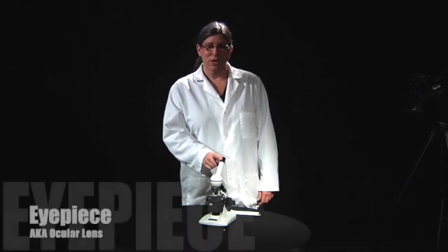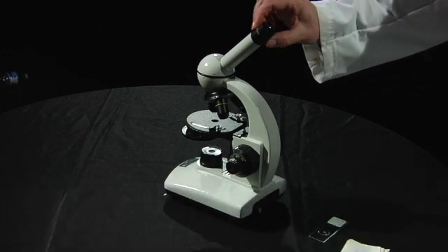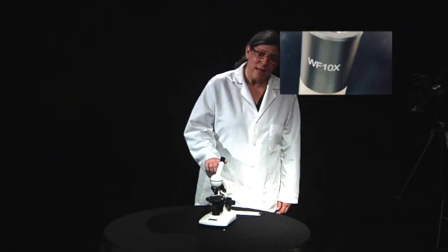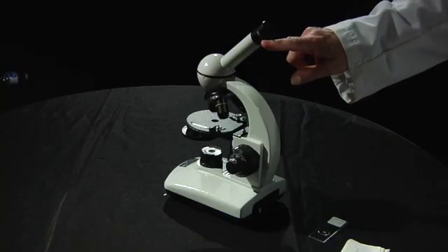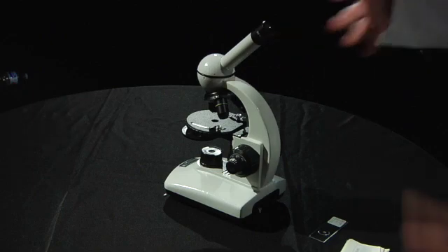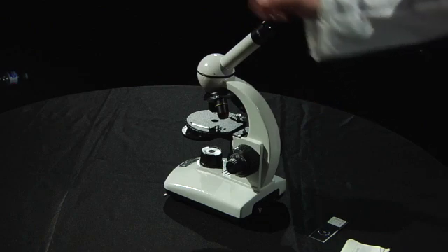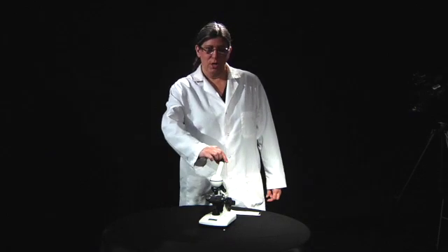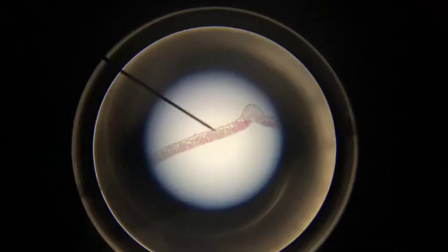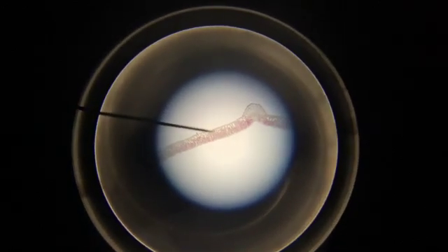This part right here is called the eyepiece, also known as the ocular, and it has a magnification of 10x. You can see right here that it says on the side 10x, and that means that the microscope has a 10 times power of magnification compared to just your plain unaided eye. If you look in the eyepiece, you will see a pointer, and if you turn this eyepiece around, you'll see that the pointer rotates around the field of view inside the microscope.